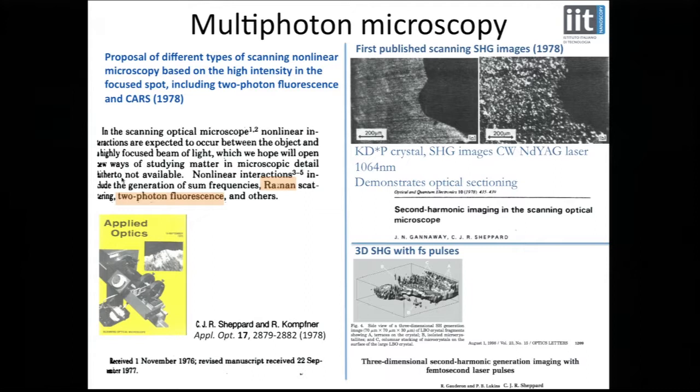And we had a paper in the same year, 1978, which shows some images from second harmonic generation from a crystal. And what's more to the point, it demonstrates the optical sectioning, because here you see these different focus positions, completely different images. So that was multi-photon.